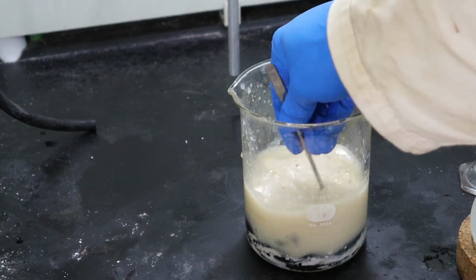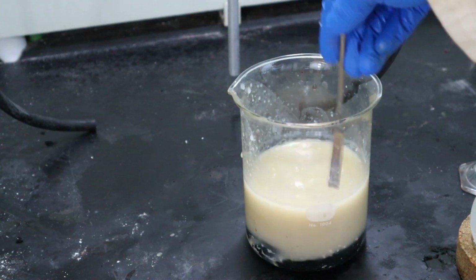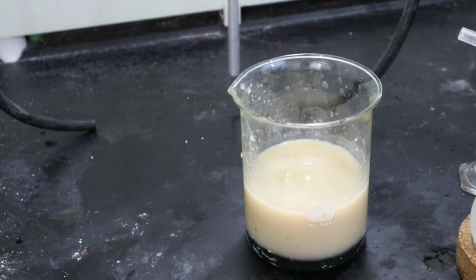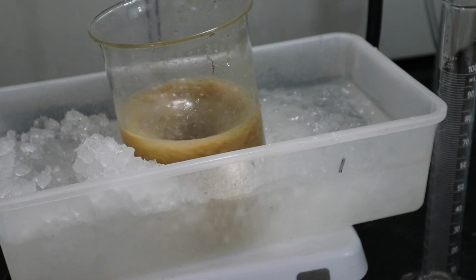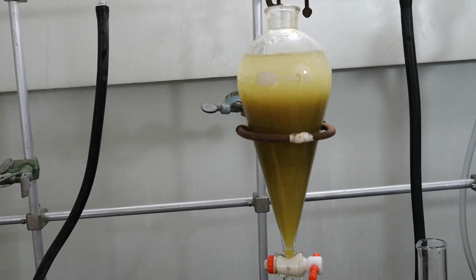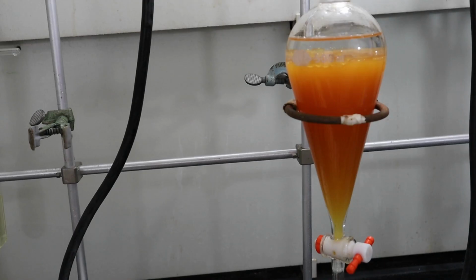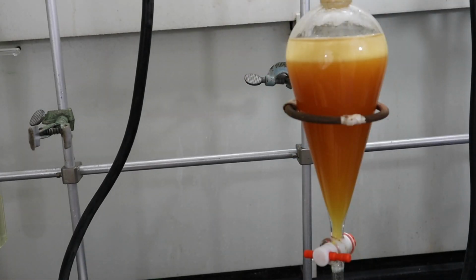The mixture separated into an upper aqueous layer and a lower dichlorobenzene layer. At this point, I was concerned about chunks of aluminum chloride that were under the dichlorobenzene and were not getting hydrated. Therefore, I placed the beaker in an ice bath and stirred it to keep it cold until all the aluminum chloride dissolved. I extracted the aqueous phase with 2 100 milliliter and 2 50 milliliter portions of dichloromethane, also called DCM. I washed the combined extracts once with water, producing a bright orange color.